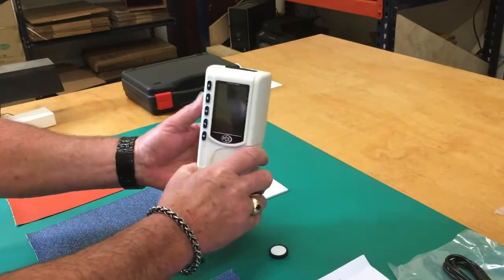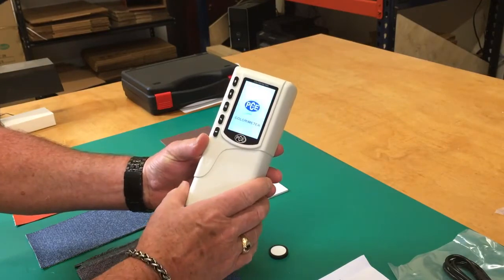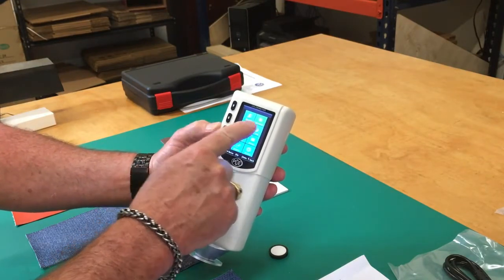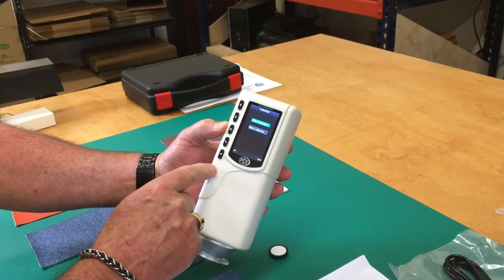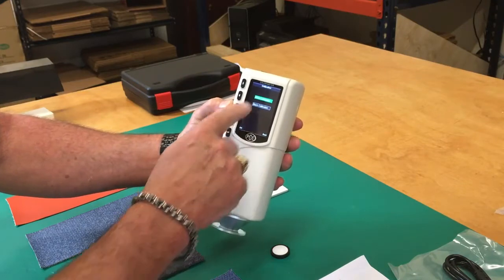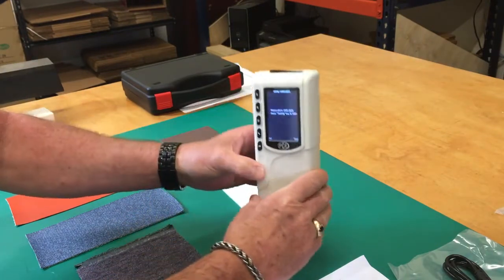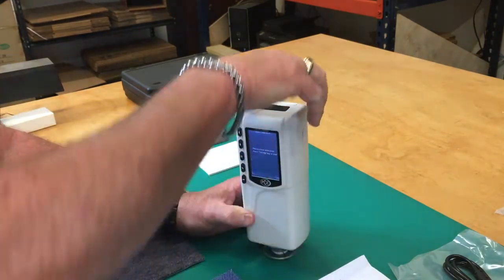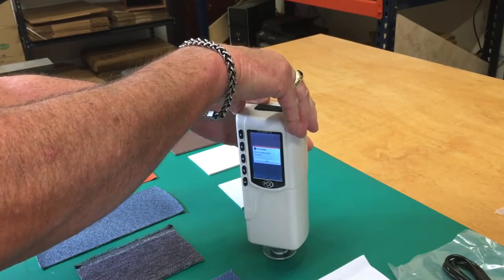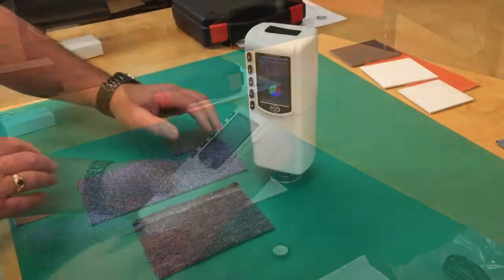To calibrate, after we have it on, we go into the menu button and we select calibrate. Enter. White calibration. Calibration standard — select white calibration. It says please place white plate for the testing here. Calibrate with the button on the back. White calibration passed.